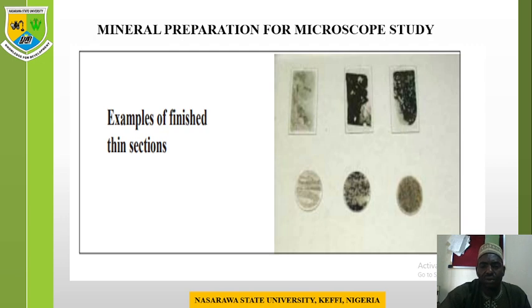Here are examples of finished thin sections which are ready for microscopic view, examination, and analysis of textures and microstructures.